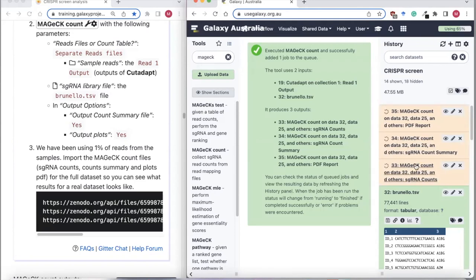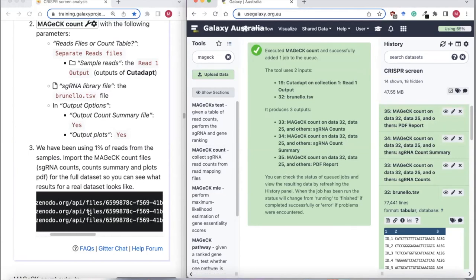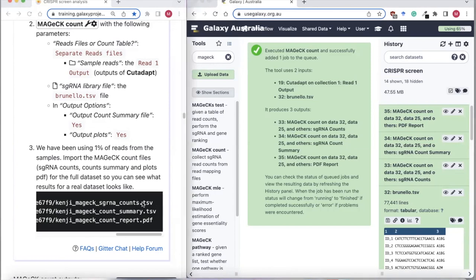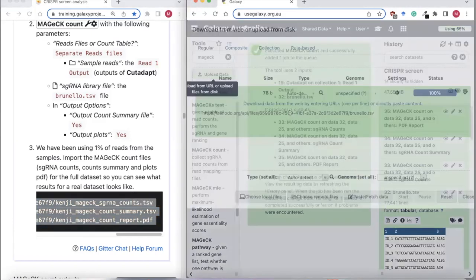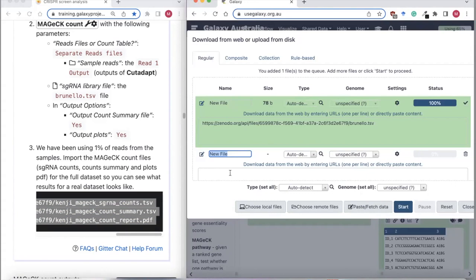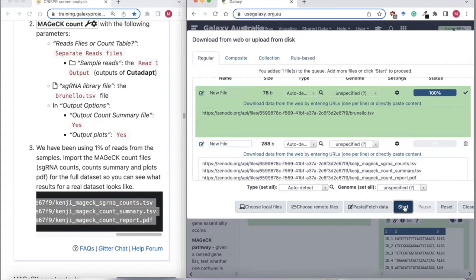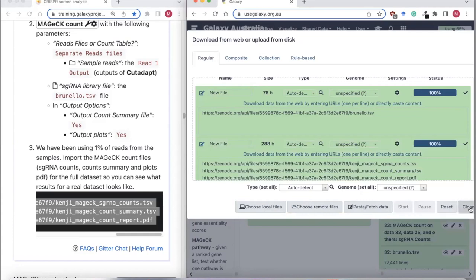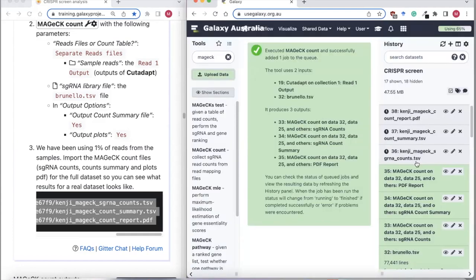However, this is using 1% of the original data, so these aren't as useful to see as what a real dataset looks like. So at this point we're going to import three files for the full samples. These three files are the same as our three samples, except these are the full FASTQ files rather than the 1% subset.